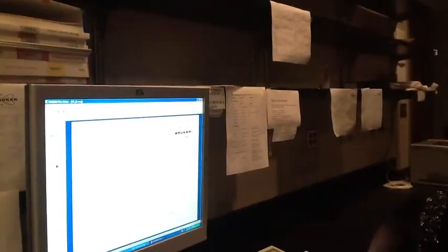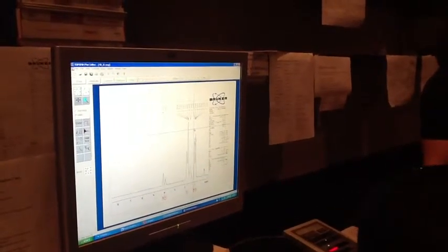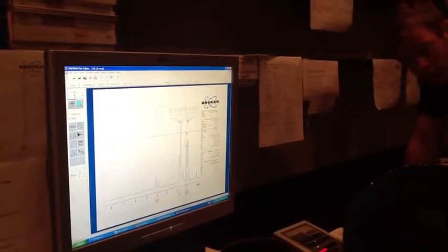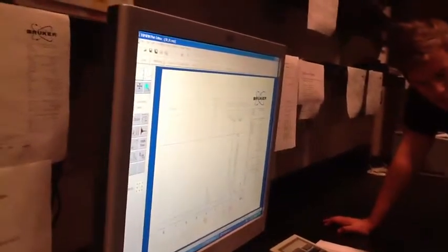So one thing you should be watching out for is this one: how many equivalent hydrogens are there? With this carbon hydrogen? No, there's none. For this molecule, two. Oh, there's two. Two, and those two. Right, yes. The integration of these will be the same. So it'll be 1, 2, 3, six. Yeah, it's six, and then the integrations for the other two would be 3, so this one will be 3, and this one will be 3.